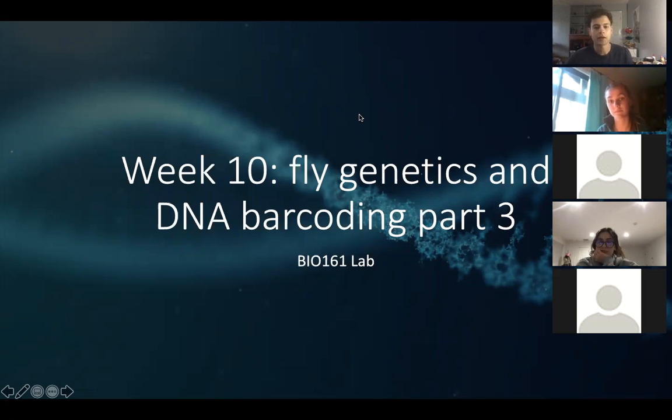This week we're going to be talking about fly genetics. It's going to be pretty similar to the plant genetics experiment we did in the past with some small changes. So you're going to be able to go over some of the statistical analysis, for example, again. And then we're also going to talk about the third part of our DNA barcoding lab. And I'm going to tell you about DNA sequencing, and that'll be cool because we'll be able to synthesize a few principles that I've taught you about in the past in this lab. So that should be interesting.